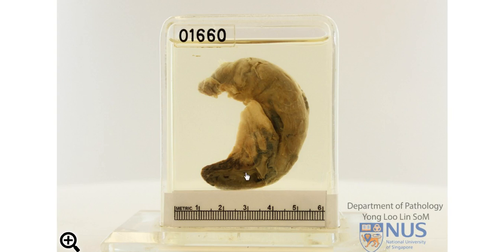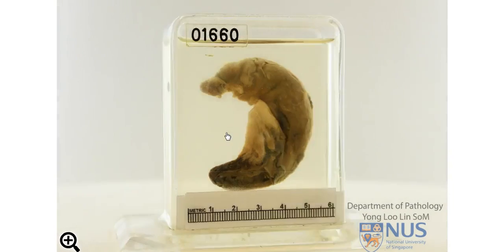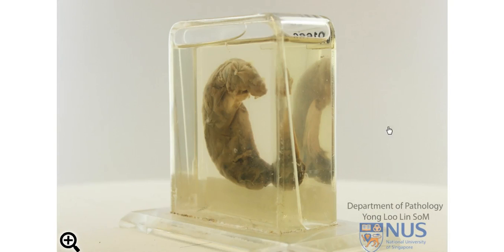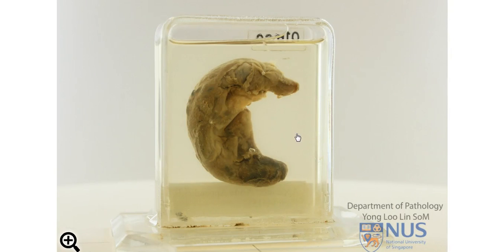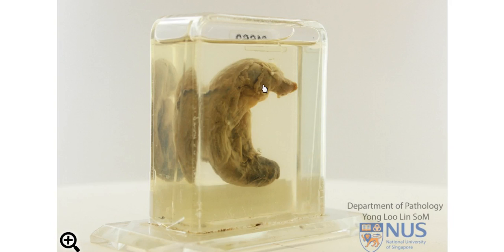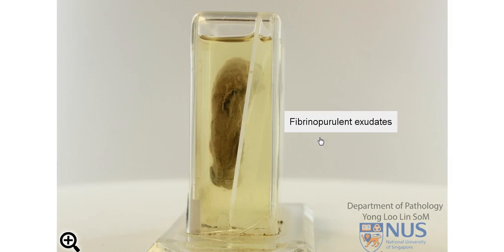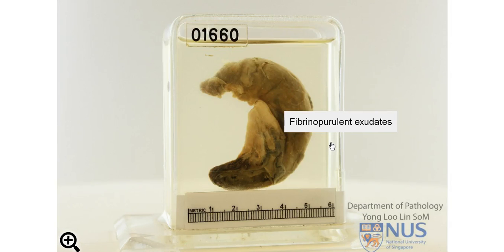We're looking inside the lumen here, and this is the cross section of the appendiceal wall. Looking at the serosa, we can see that there are some yellowish exudates on the surface that make the serosa appear opaque rather than translucent. We can appreciate the exudates a little bit better looking at this other surface, and under the microscope we would be seeing fibrinopurulent exudates — fibrin and numerous neutrophils — and this would be an acute inflammatory infiltrate or exudate.